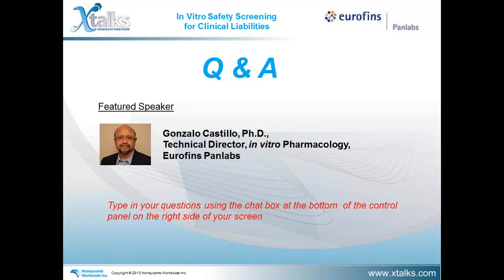So essentially the safety pharmacology assays you'll be taking a look at in development can be performed inexpensively in a non-GLP fashion in rodents. The last piece as well that Gonzalo mentioned was actually taking a look at cardiomyocytes that we are in the final stages of validating that would actually be a cell-based assay that would predict those cardiovascular events. Now, if this answer is not sufficient, what I would encourage the person who asked the questions to contact us, and we would actually have a specialist with respect to safety pharmacology help design an experiment or help answer questions in a much deeper fashion.